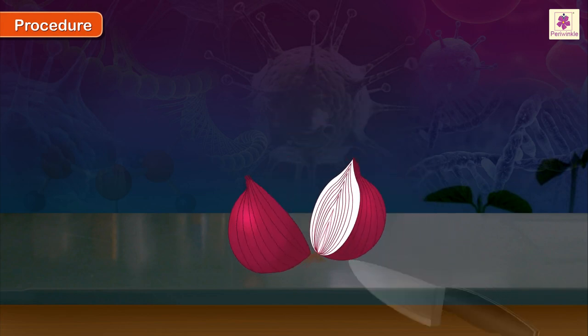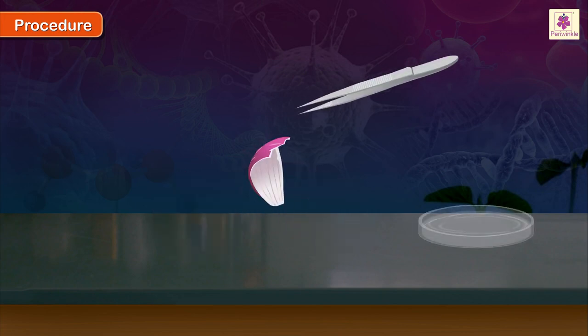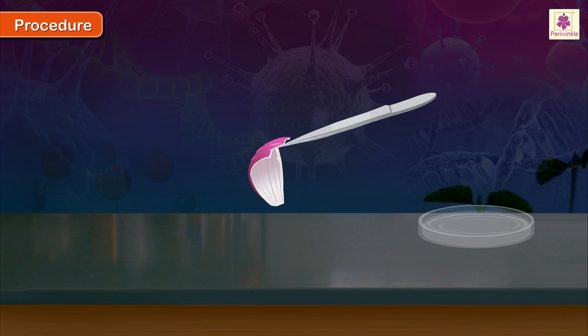Carefully cut an onion and take a piece of a thick fleshy leaf. Use forceps to gently remove the thin membrane-like transparent peel from the inner concave side of the leaf.